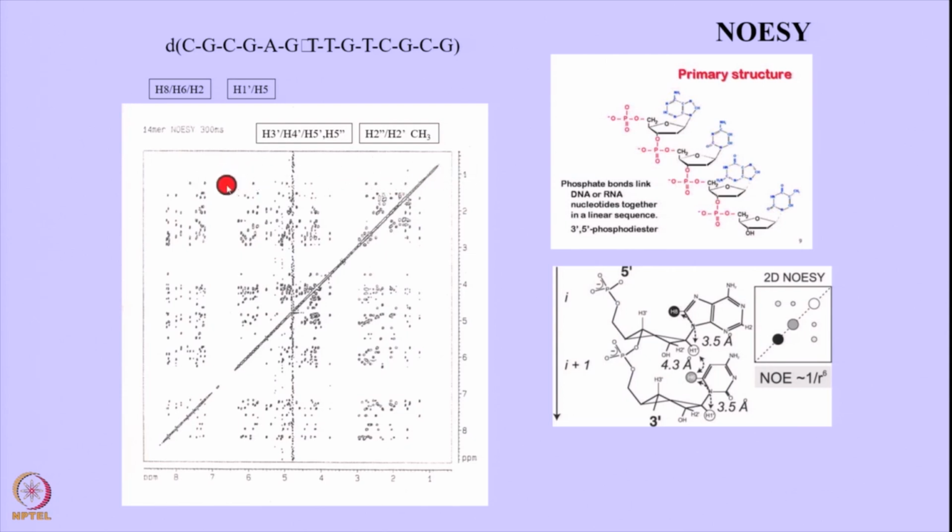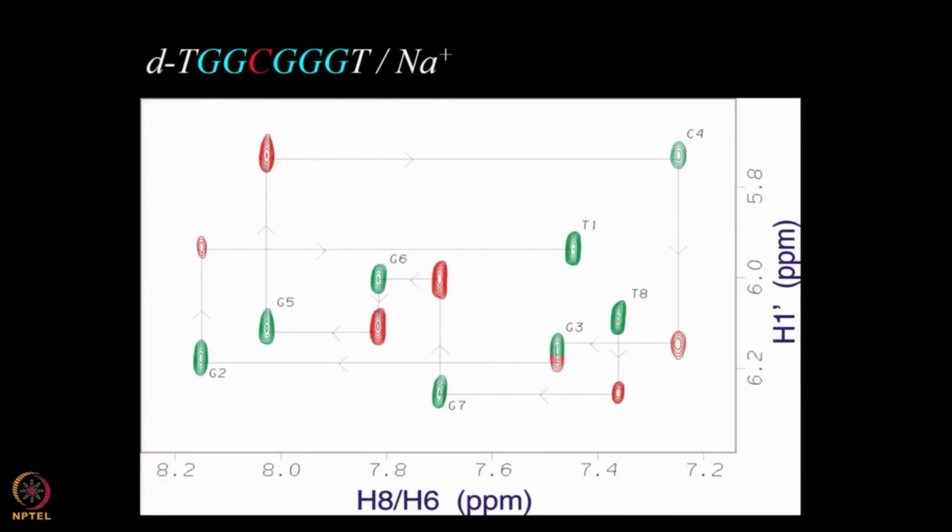There are 3 of them here, you can see them very strongly, these 3, and therefore this fixes the positions of the thymines here. So, everything that you do should be consistent with that. That actually provides a very good starting point here. I will illustrate this to you in this particular sequence. We saw this last time, but I will go over it again. You start with the T at the 5 prime end, then the T at the 3 prime end.